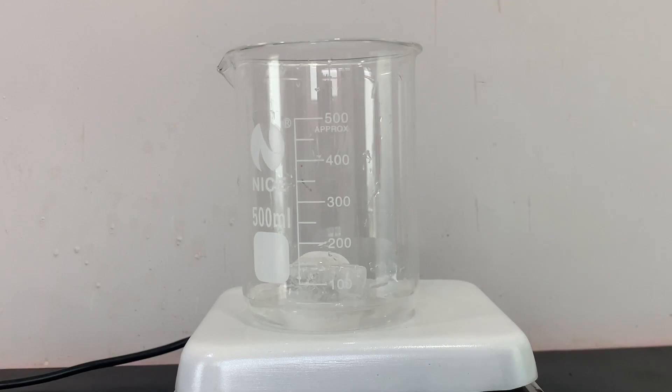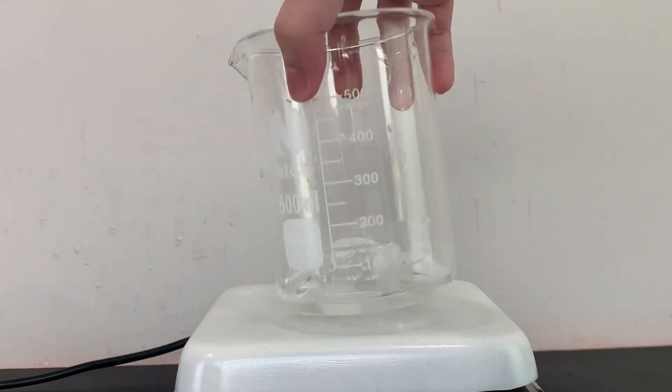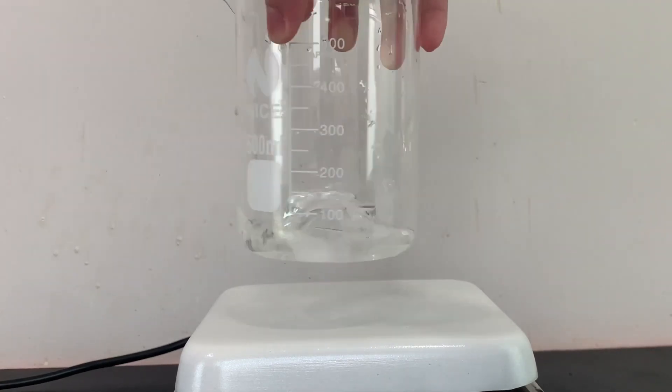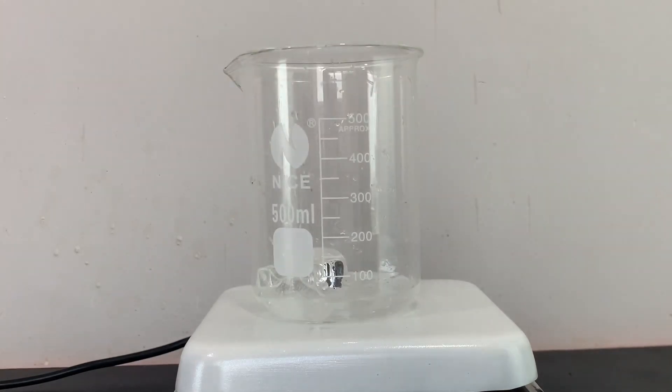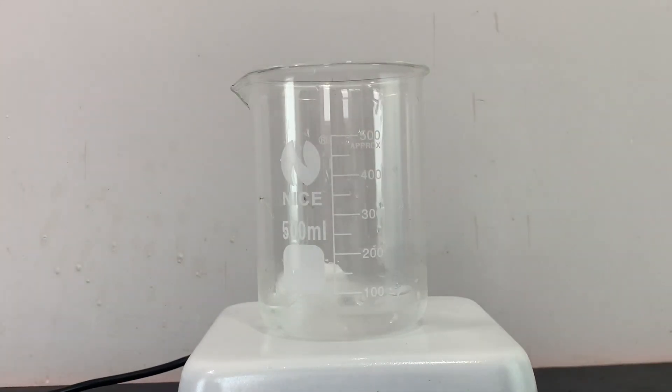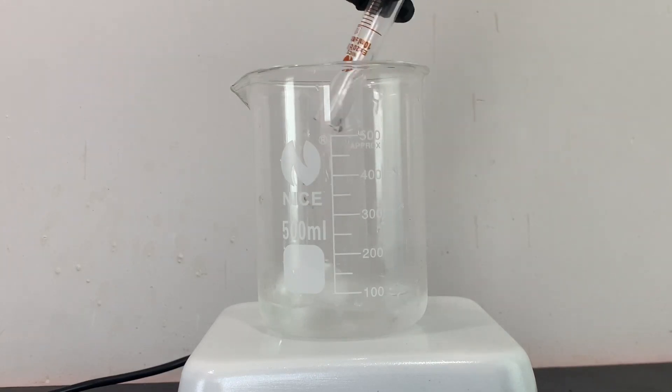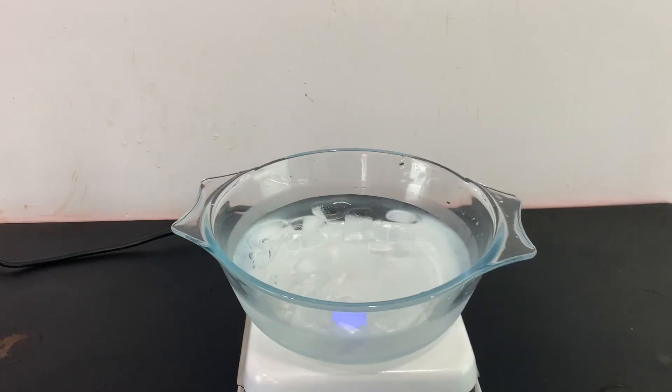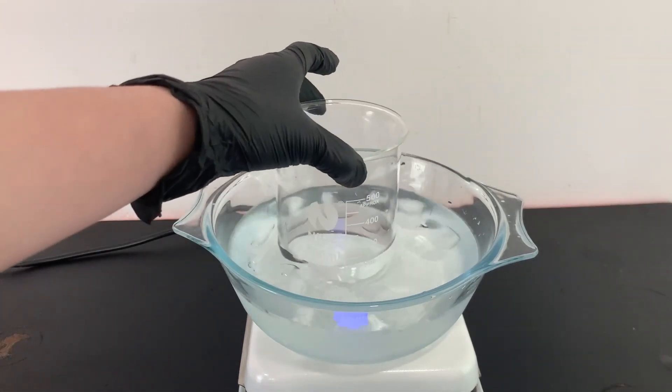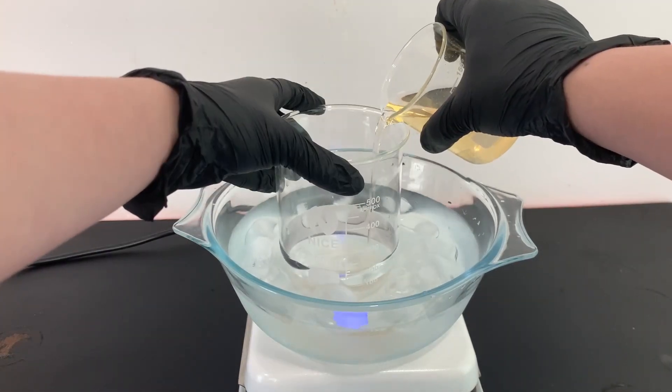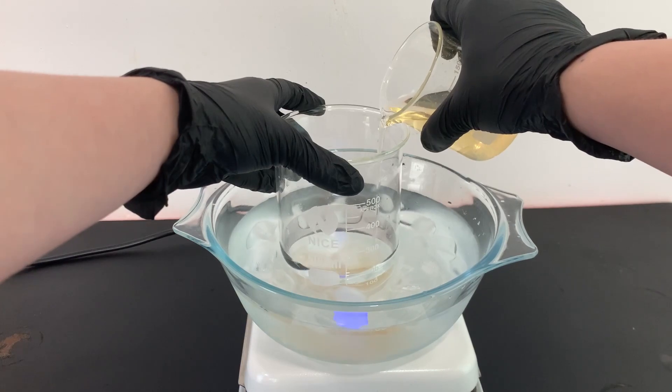To the 500 milliliter beaker, I added two ice cubes and poured in 25 milliliters of water. To the ice water mixture, I added 5 milliliters of concentrated hydrochloric acid. I cooled the 500 milliliter beaker on an ice bath and then poured in the contents of the 100 milliliter beaker.